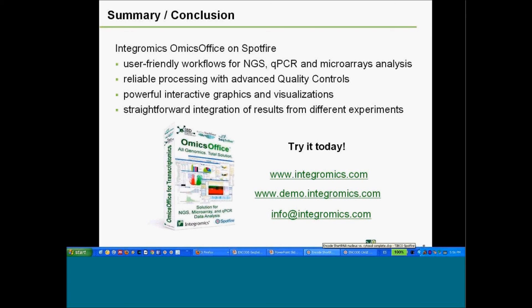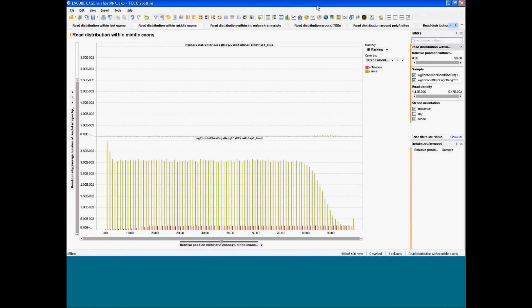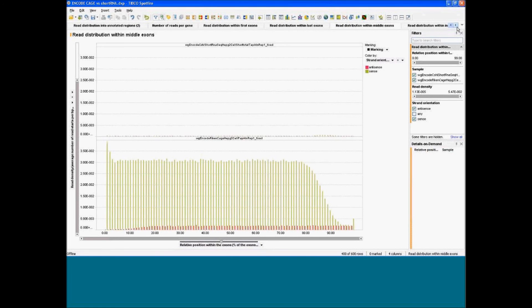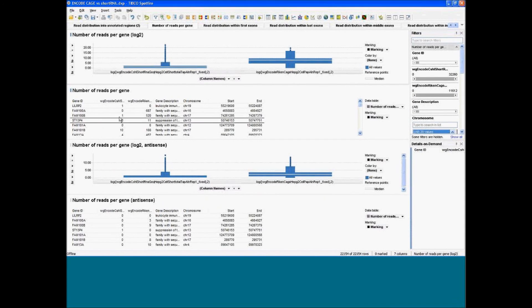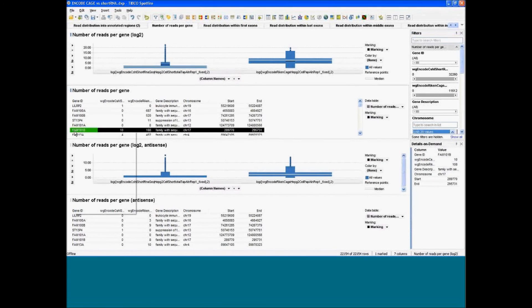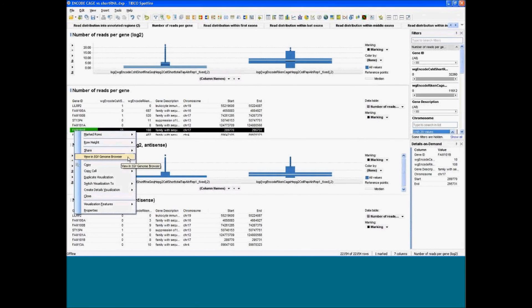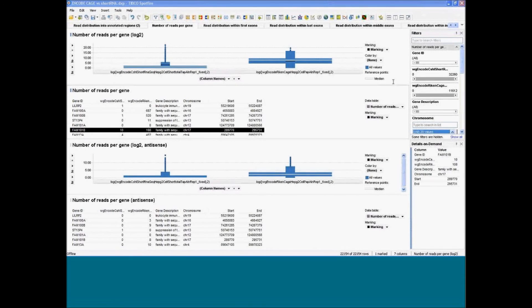Yes. It's not in the same Spotfire window, but you can see reads on the genome. You have a list of genes — for instance the total read count per gene. If you select a specific gene, you right-click and launch the IGV genome browser. That opens IGV, loads the read data, and focuses automatically on that gene.